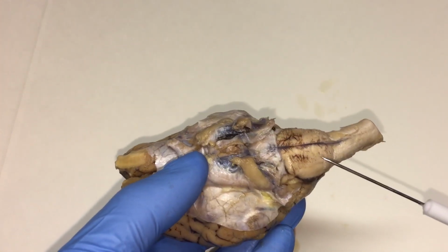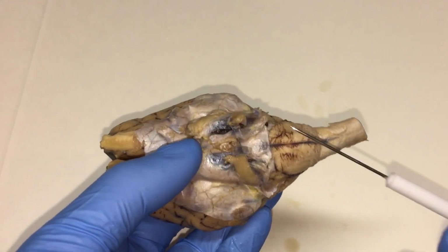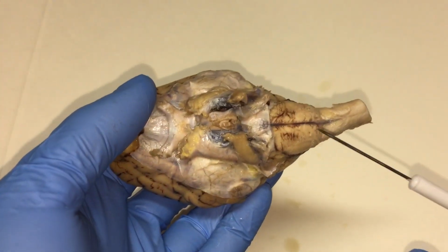This right here is actually one of the earlier parts of the brain that develops. And it's a more primitive area of the brain because nothing else develops unless the sheep or the animal is breathing.